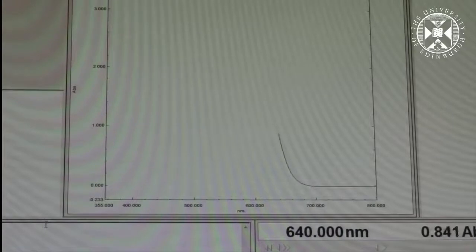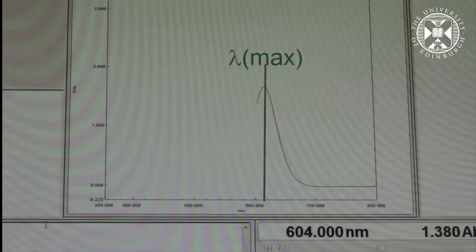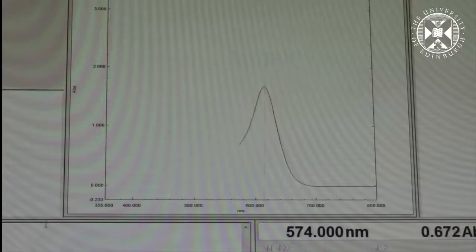Once the spectrum runs we can identify the wavelength at maximum absorption. We choose this wavelength for monitoring using a kinetic scan as this will best reflect the changes in intensity of color as the hydrolysis reaction proceeds.